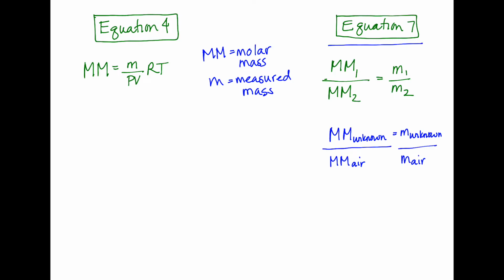Now let's review what kind of measurements we need to make to be able to do these calculations. When I'm working with equation 4 here, the kinds of things I'll need to be able to measure is the mass of my unknown gas.